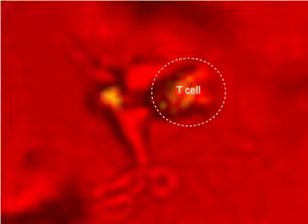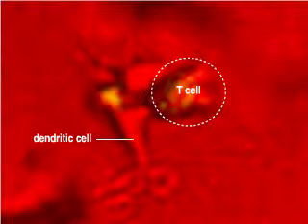In this video, we can see a T cell that becomes activated when it interacts with the dendritic cell. The T cell is labeled with a dye that fluoresces when it binds calcium ions.